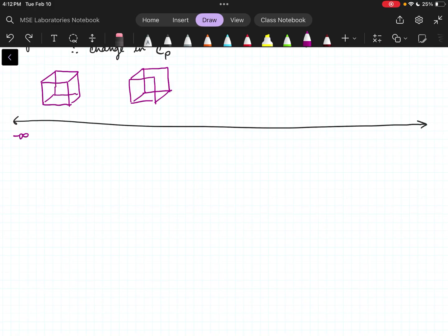How are we going to do that? We'll say right here is 0 degrees Celsius. And down here is negative infinity degrees Celsius. We could talk in Fahrenheit, we could talk in Kelvin, but we've got the melting temperature of water. In this whole range right here, we are perfectly stable. The ice is ice. It is a solid, it is not changing. It's colder or it's warmer, but as far as where the molecules sit and how they're reacting with each other, there is not a change. What starts happening at 0 Celsius?